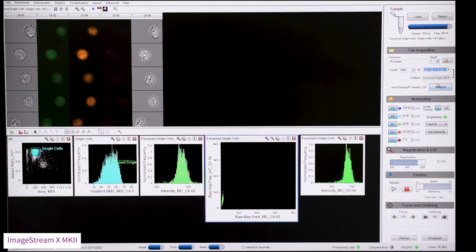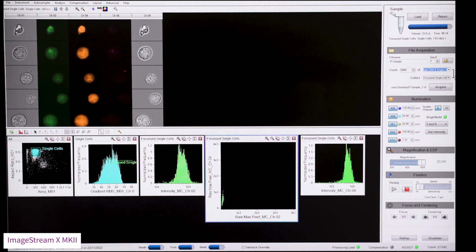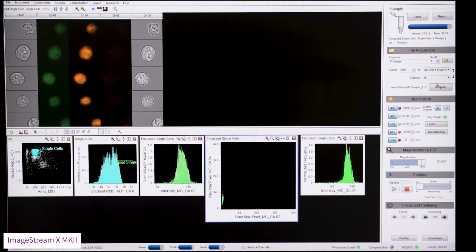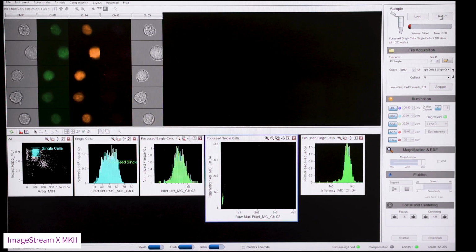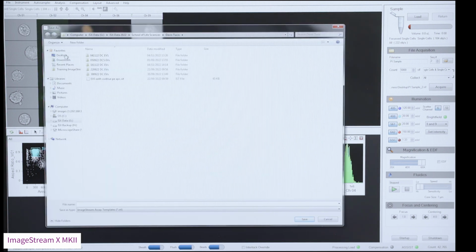You have the option to collect just those, or if we unlink this, you have the option to save all of the data, which is a safe way to do it, and we can adjust the cell gate later in the data analysis. Press Acquire and the machine will run and save your data. When finished, return the sample and run any other samples that you have. Save a template by pressing File, Save Template. Next time that you run your samples, you will not have to set magnification and laser powers again unless your staining has changed.